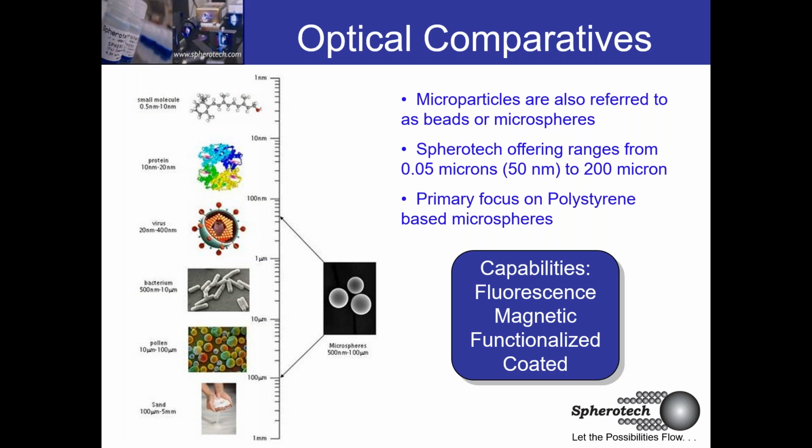But really, we're talking about optical comparatives. That's what these beads mean to you. They are rulers for that cellular and subcellular world, right?